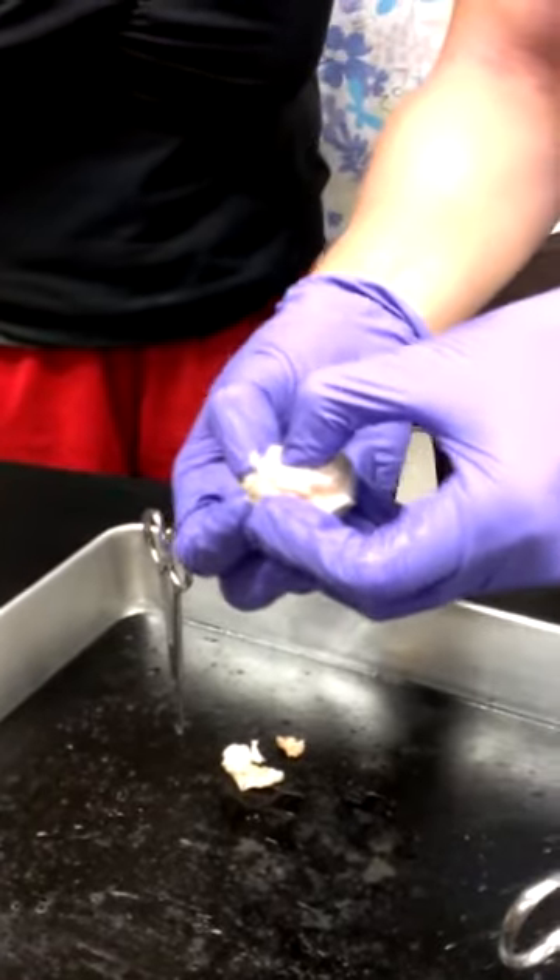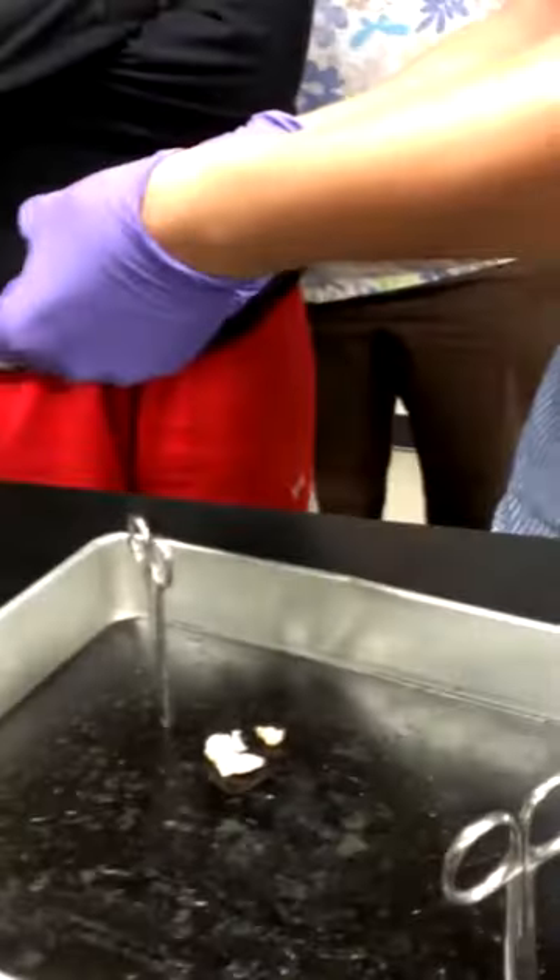It's kind of small. You see that tube right there? That's the optic nerve.